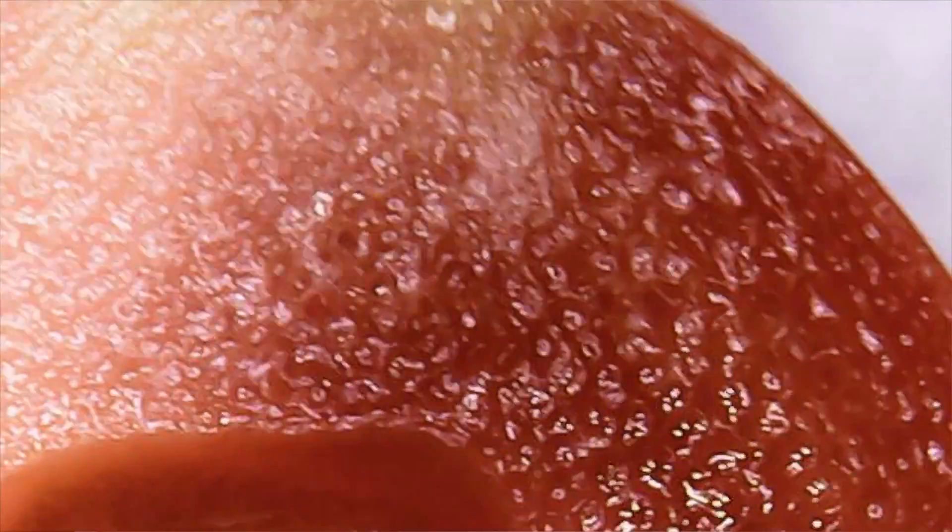Let's have a look at it under El Microscopio as well. So there you can see the flesh of, this is where the stem came out there. Flesh here, freshly sliced. Sliced that just now with a knife. The juice in there, they're not filled all the way up to the top, obviously.